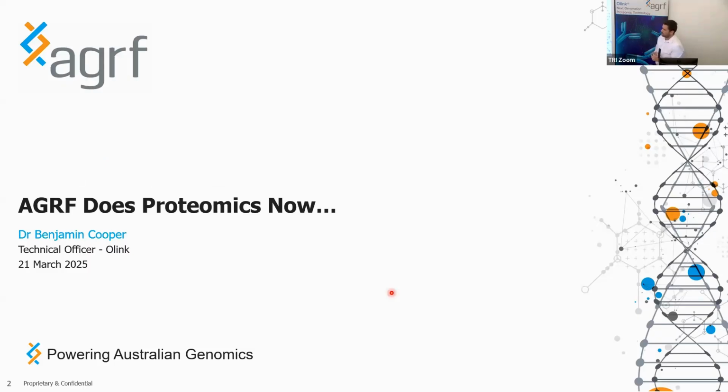But also with specific reference to proteomics, the field of proteomics is in a very interesting stage at the moment. There are a number of technologies entering the market and being widely adopted by researchers, to some extent clinicians, and in industry settings as well, which utilize existing genomics and transcriptomics expertise and workflows to analyze proteins. And so you can appreciate that AGRF, with its exceptional expertise in those genomics and transcriptomic fields, these new proteomic analyses really do fit in well with our existing expertise.